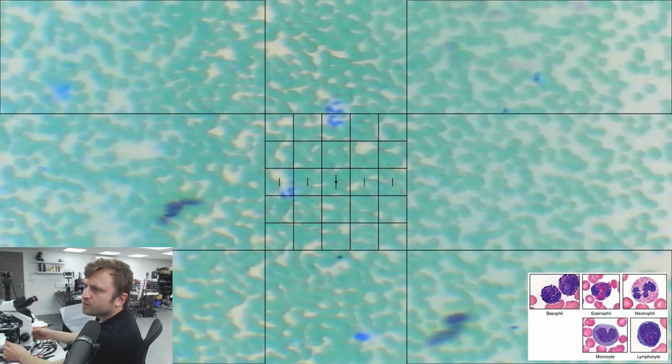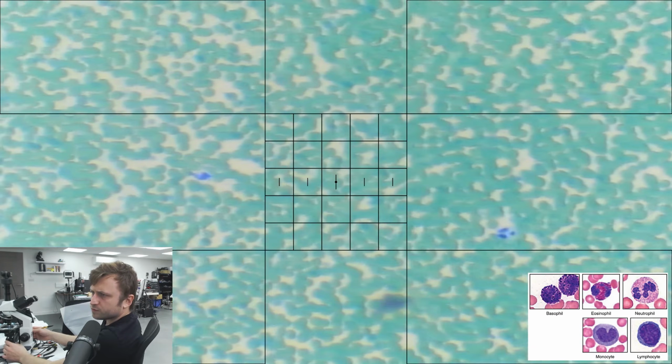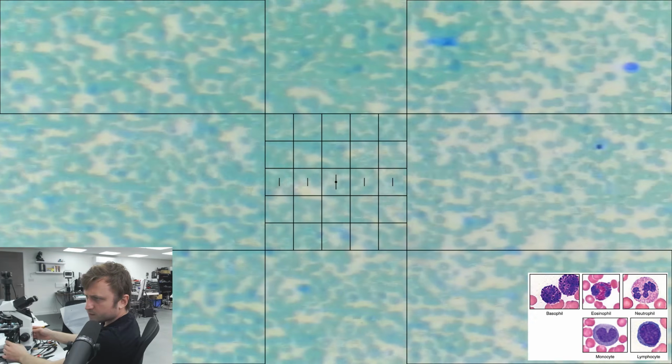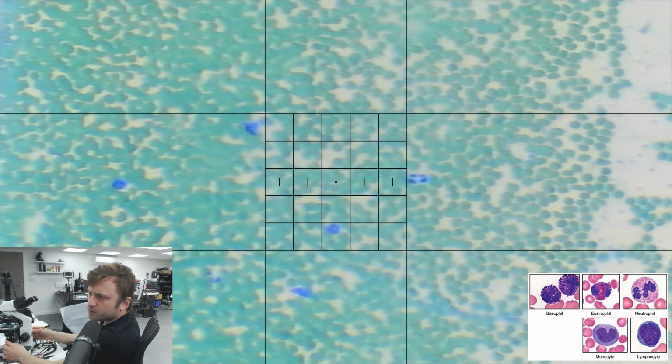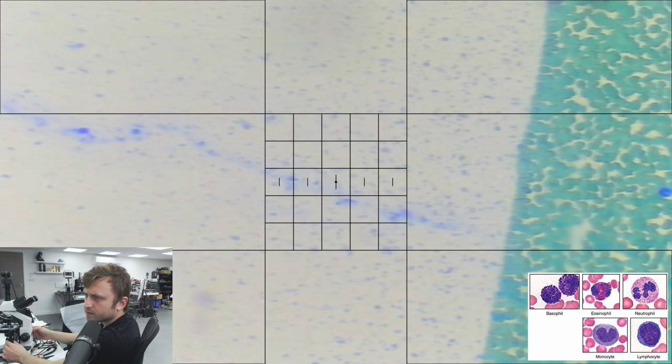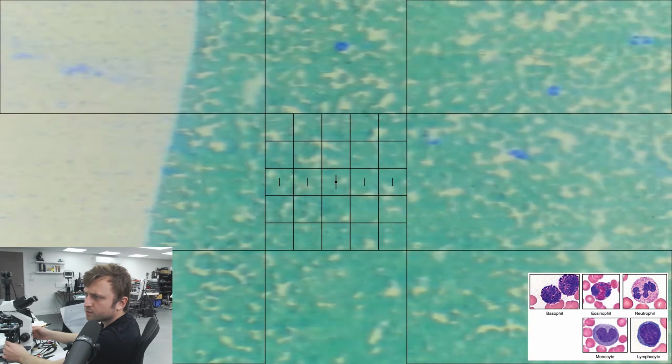Leave that there. 2 neutrophils. 3rd neutrophil. Unknown. 1, 2, 3. Unknown. Not sure about that dot there. I won't count that. Neutrophil. Lymphocyte. Unknown. Lymphocyte. We're on 70 now. Nearly 100. Proceeding down. Next row.